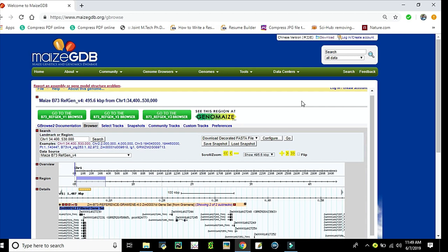The primary function of genome databases is to provide an easy and efficient way of retrieving data regarding sequence information. Here in MaizeGDB, we have the B73 reference genome. It is copied from databases known as Gramene and GenBank. The B73 reference genome was first sequenced and uploaded in 2009 and has had several updates in the genome browser.